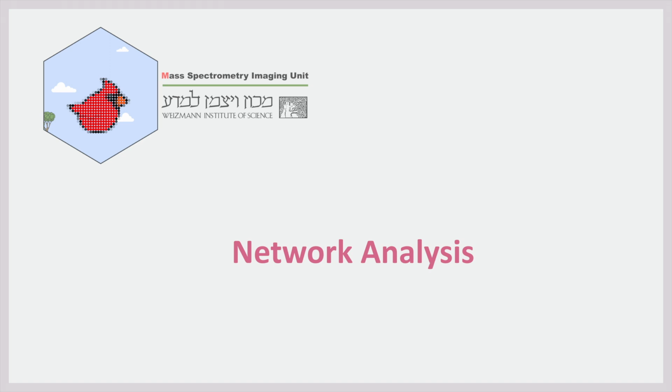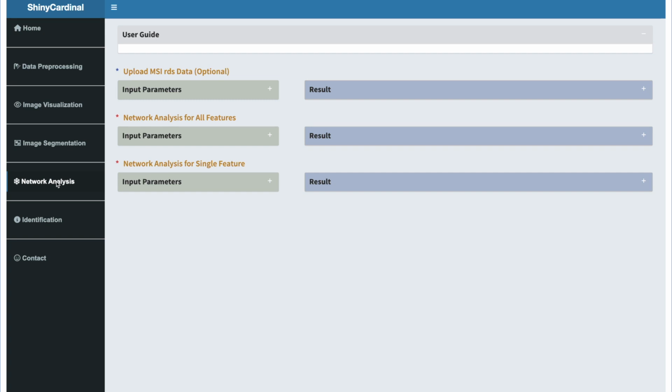This video tutorial is for network analysis. Molecular networking groups metabolites that are structurally related, or have similar biological functions. It is widely used to identify unknown metabolites and discover novel metabolic pathways in metabolomics studies.